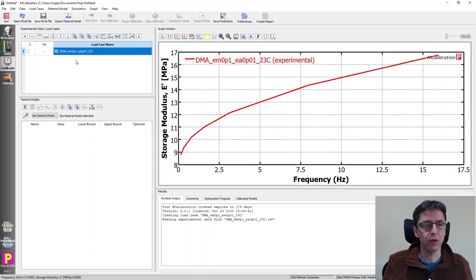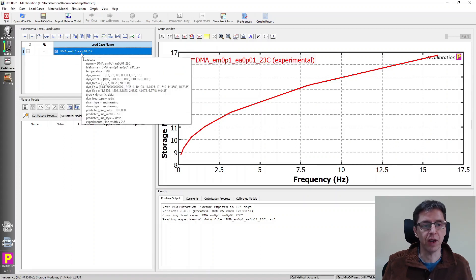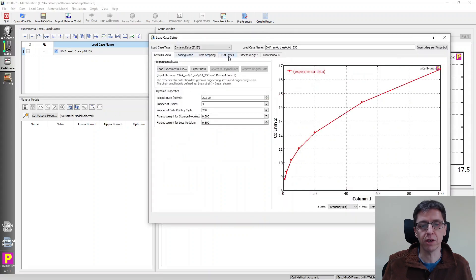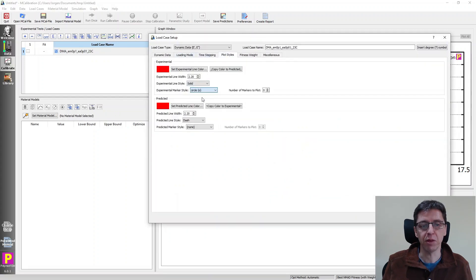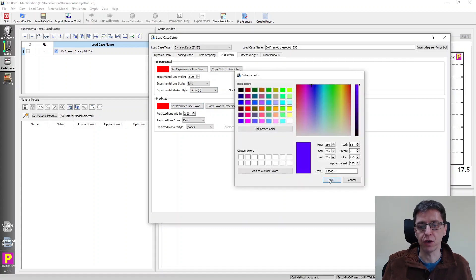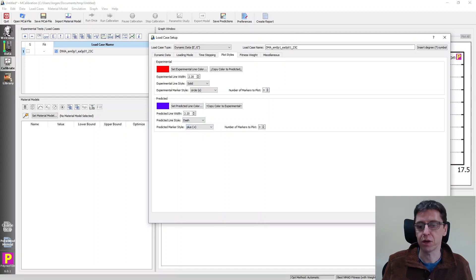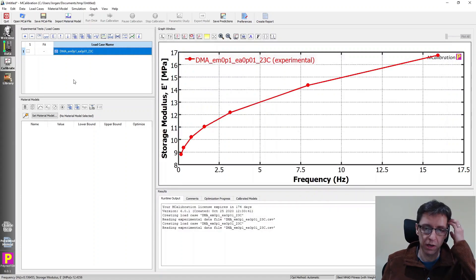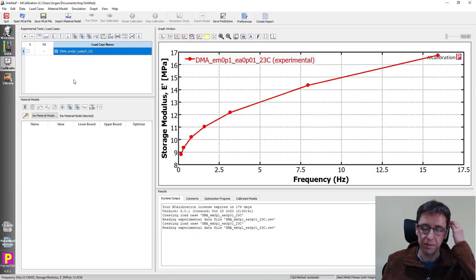Since we had just a few data points, I'm going to change the graph a little bit. I double click on this one. I'm going to go to plot sides. I'm going to add an experimental marker. And the predictions, I'm going to switch them to be a different color so we can see them better. And we'll do a different marker. All right. So there we go.